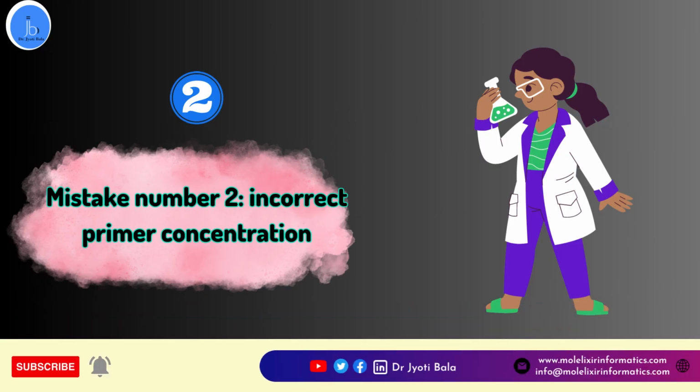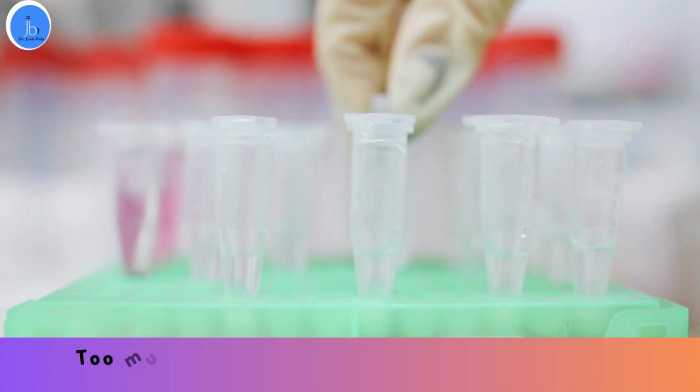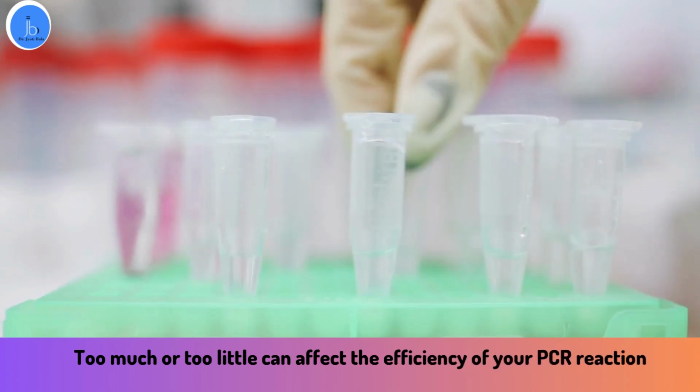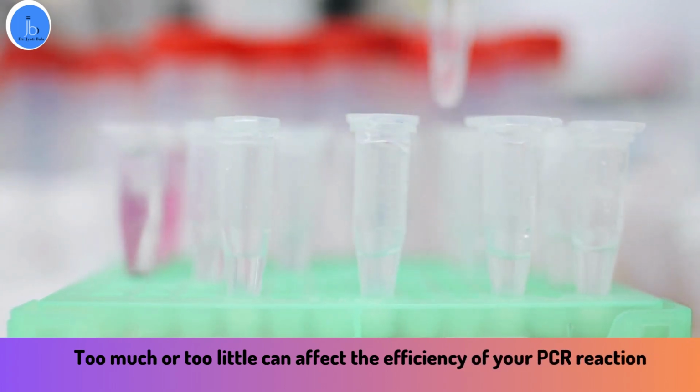Mistake number 2 is incorrect primer concentration. Ensure that your primers are properly diluted to the recommended concentration. Too much or too little can affect the efficiency of your PCR reaction.